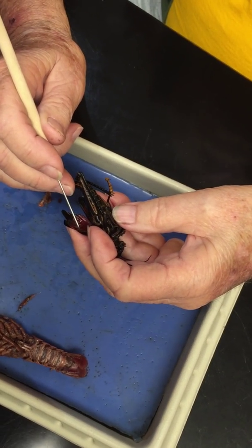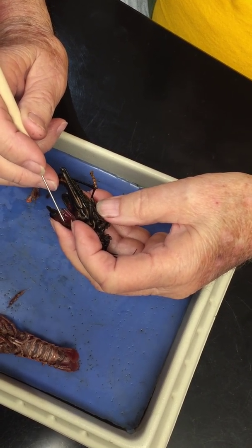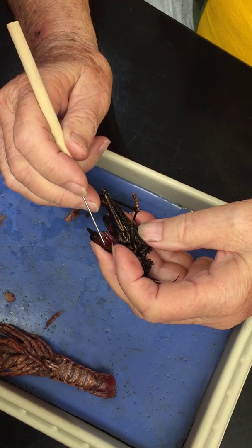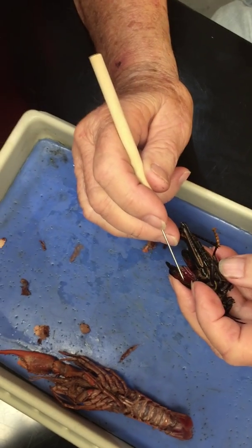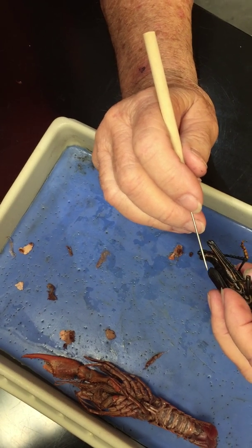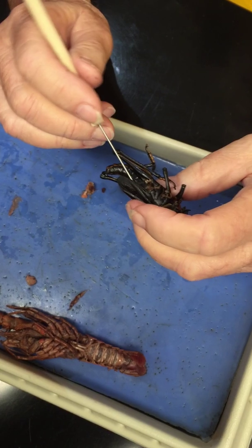Basically, dead tissue. It uses the trachea to help blow it up, but after it's blown up, everything there dies. So you can rip off a butterfly's wings or rip pieces out of it. That's the end of it.